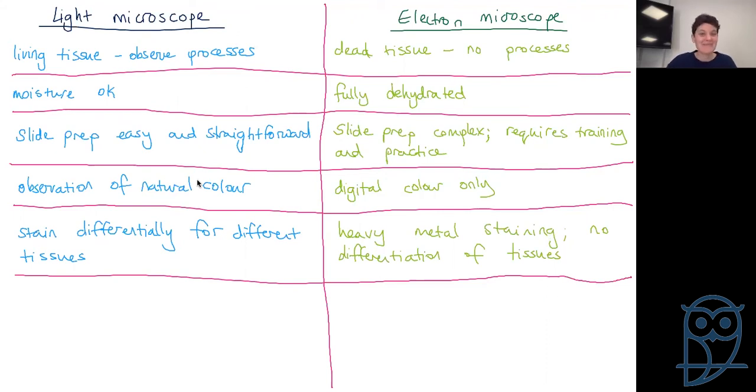And our last one, the relatively sort of deciding factor on top of all of this, is that a light microscope is relatively cheap to purchase and service. Okay, schools have collections of light microscopes. You as an individual person could buy a light microscope if you wanted to, and you would be able to buy it and you would be able to service it regularly, and it would all sort of fit in within a normal person's budget, if you budget for that sort of things instead of maybe washing machines. But yes, a light microscope is something that you could save up and buy.